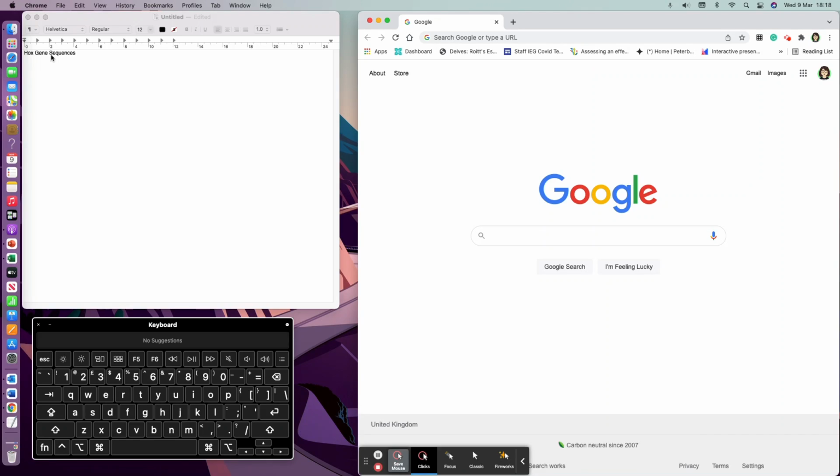Before we go any further, we're just going to have a look to see how we can use our different shortcuts. So first off, you are going to be highlighting quite a lot of things. So the best way to highlight is to do Control A. You can see that on my little keyboard at the bottom right there. If you want to copy something, then you want to go Control C. If you then want to paste something again, Control V. Nice and simple. That saves you from just having to use your mouse and to highlight sometimes thousands and thousands of sequences that you're looking at, so thousands of letters at a time.